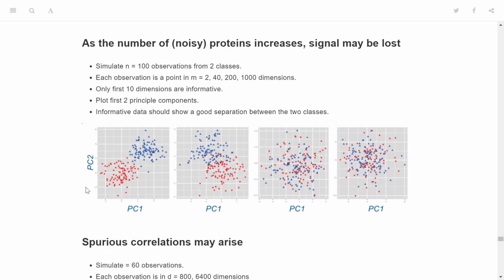So this would be kind of noisy data, because based on these proteins we are not able to define two well-defined classes. As opposed to here, where we tend to have high signal for protein 1 and PC1 for one group, and low signal for the other group. So we have good separation or bad separation here.